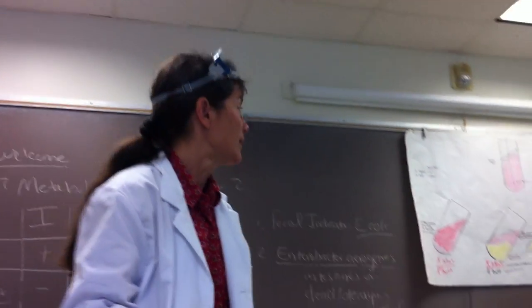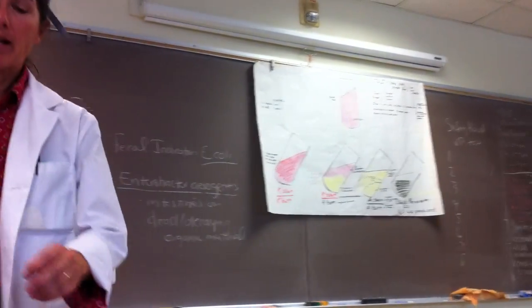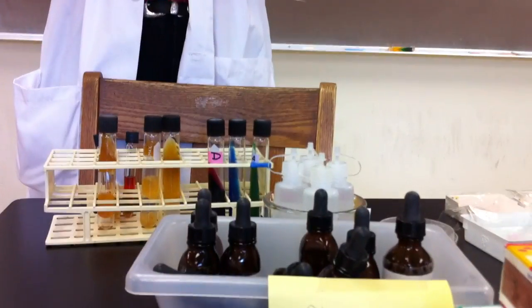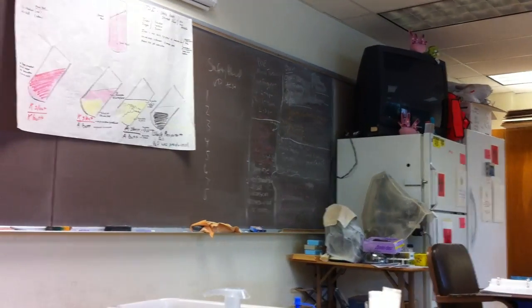Okay, I think that's it. So with these, when you're finished, please make sure to take all the tape off, loosen the cap slightly, and put them in the kill area. We've set up some pretend lab practical stations in the back, just to give you a little bit of practice on these.